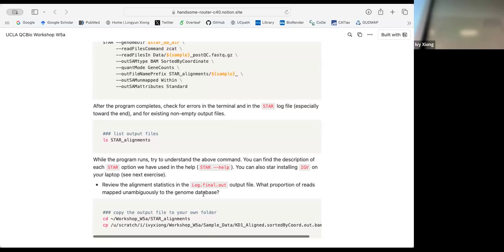That's not the raw file, so what should be the file? Those are the raw files, K1.fastq and C1.fastq, 3 GB. So I have to zip that. Yeah, you zip it, or you can just copy the zipped version from the exercise folder.